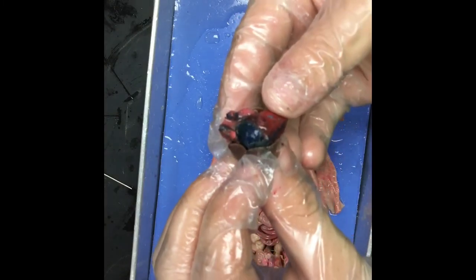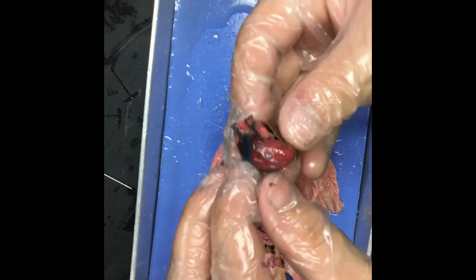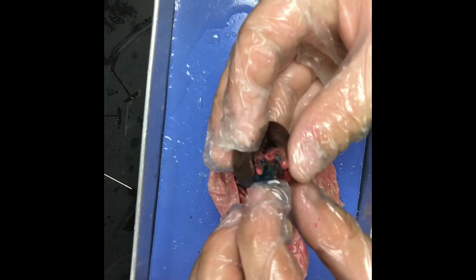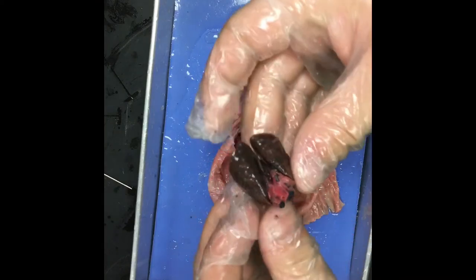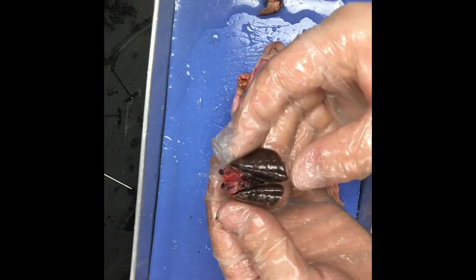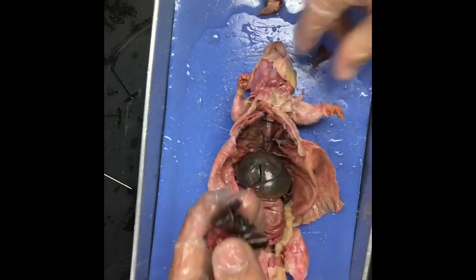So, as you see here, you have the blue. That's going to be the deoxygenated blood, your veins. The red is the arteries. So, different chambers of the heart are color-coded accordingly. So, these are your lungs attached to it. One is bigger than the other, same as in humans. So, I'm going to remove the lungs from here, again, very carefully.